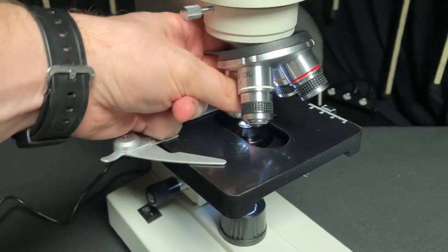Jack here and I'm looking at this Vever laboratory style trinocular compound microscope with a 40 times to 5,000 times magnification range. Full disclosure, this was sent to me for an honest review.